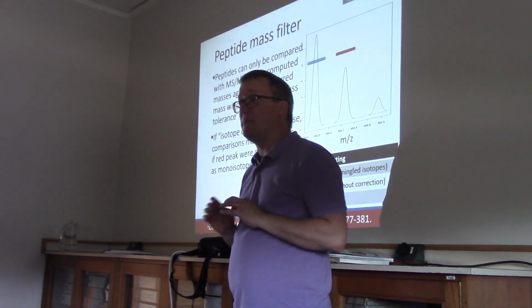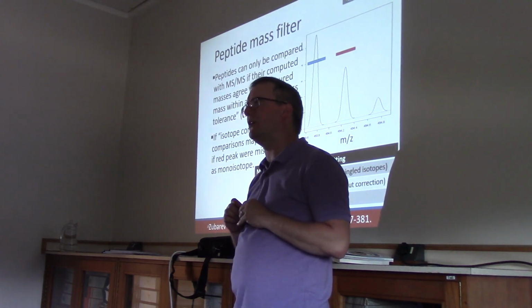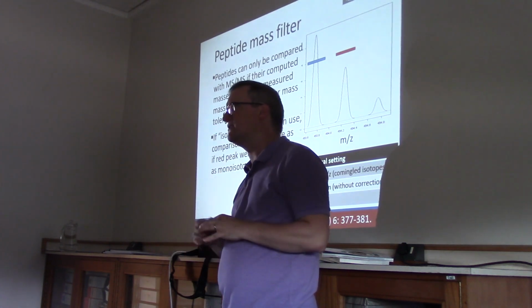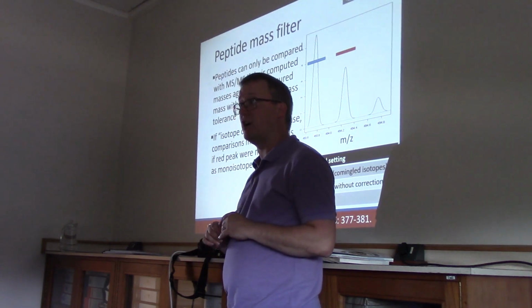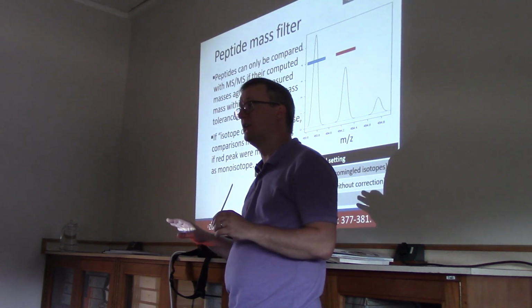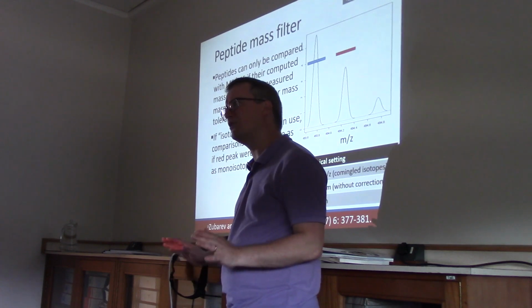People use a lot of different mass specs to do tandem mass spectrometry. I talked about high-resolution mass spectrometry measurement of peptide ion masses, and I showed you a little picture of something that we call an Orbitrap, which is one of the most widely used instruments for this. There are, however, lots of people doing mass spectrometry and tandem mass spectrometry on simple ion trap instruments. They're certainly a lot cheaper, and they don't die.